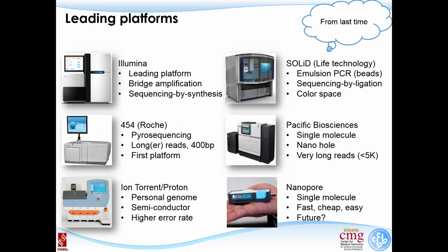The last one we discussed was the nanopore sequencer. Remember, this double layer, the inside and outside, the electrical signals are different, but you have another protein called a nanopore sitting across that double layer, so that when a molecule goes through that protein, it will change the electronic current between inside and outside.